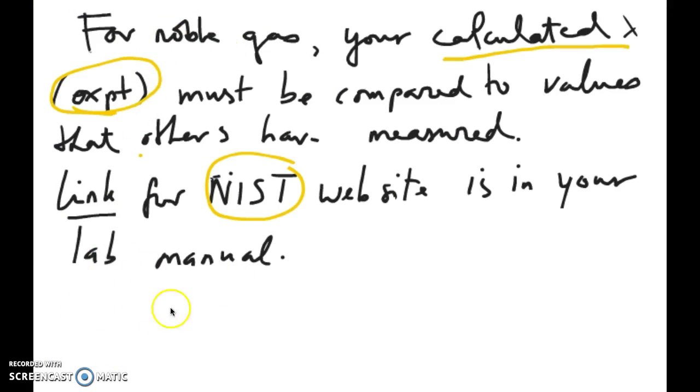Now, once you have that calibration data, then it's just a matter of measuring two additional sources of light. You're going to use a noble gas for the second part. You're going to measure five of the wavelengths that come out from the noble gas. Later on, when you calculate the wavelength, you have to compare that to a source from an organization called the NIST. And basically what you're comparing is how's your experimental measurement compared to a value that people have accepted as convention for that wavelength.